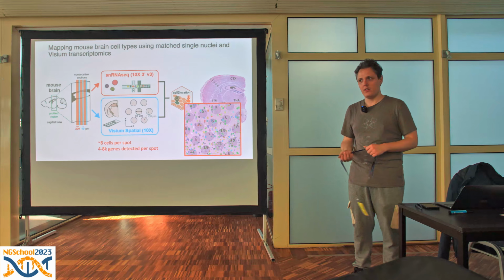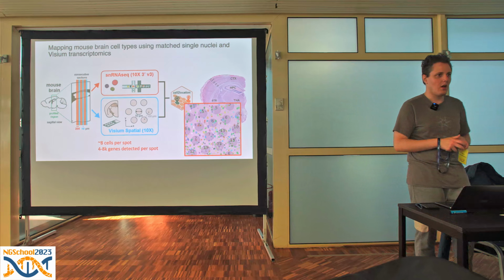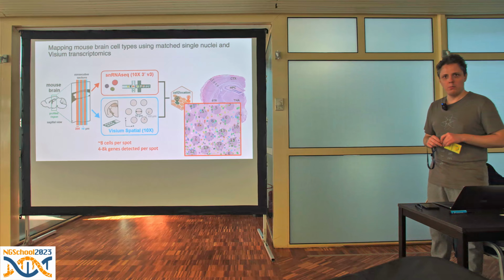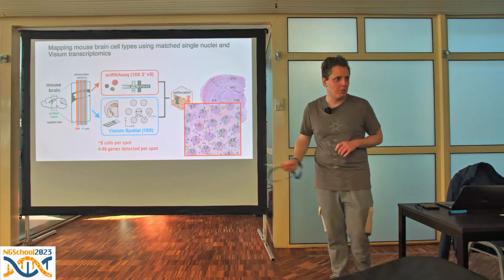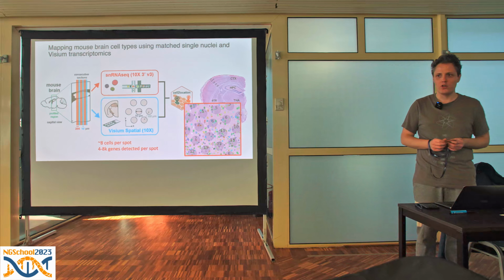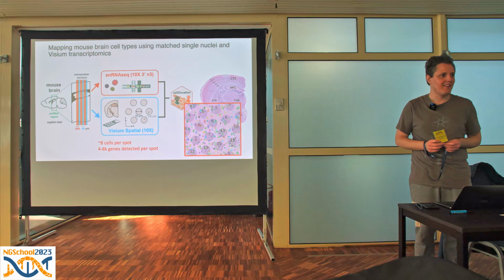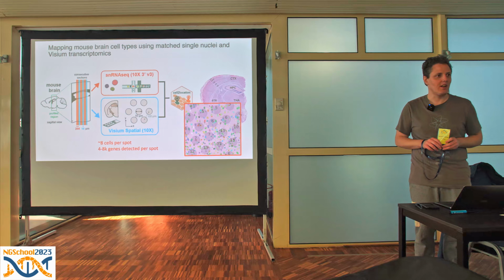But the concern is that we don't know to what extent those probes are specific, and also it wouldn't be applicable to any kind of species, whereas this spatial transcriptomics technology can be applied to unusual species like tortoises and lizards and so on. And I've seen some examples of that recently. So that would be one of the positive sides of just profiling RNA directly.